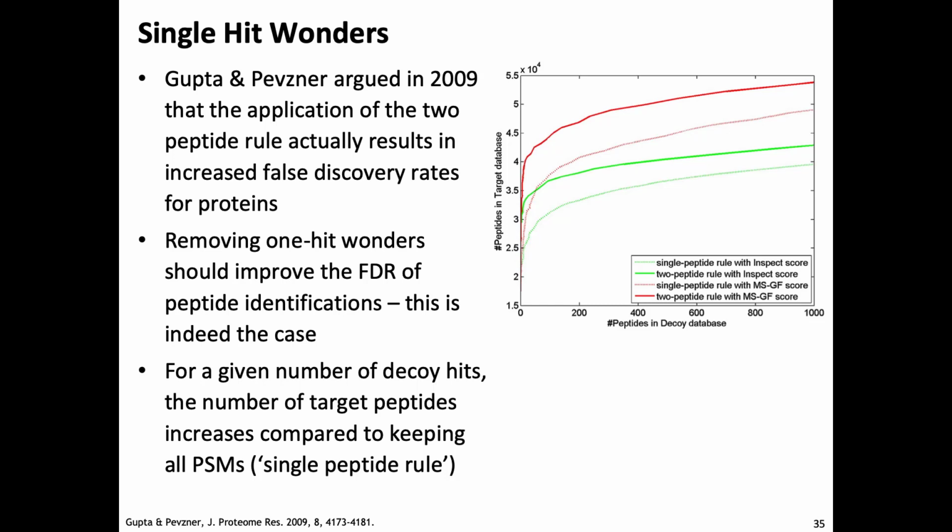So if you aggregate over many samples, what you do is you accumulate false positive identifications. So you apparently get more and more proteins, but in reality, all you get is more and more incorrect identifications because the set of true peptides that you really have in your sample is going to remain the same.